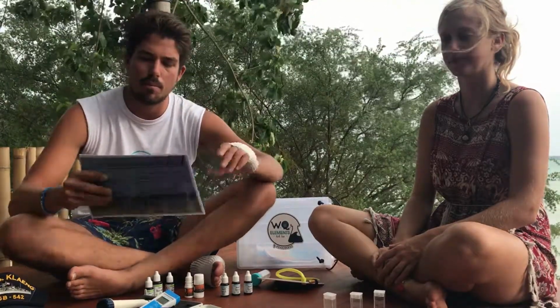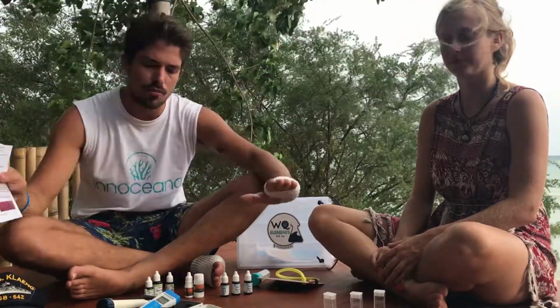We have printed it and we have laminated. This is optional. You can do this or you can use your devices, your phones, your computers or wherever. But we strongly advise that you print them and you plastify them. Then you put them in your box and you can bring them on the boat and you won't forget anything.